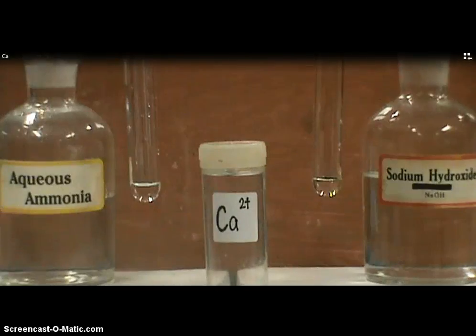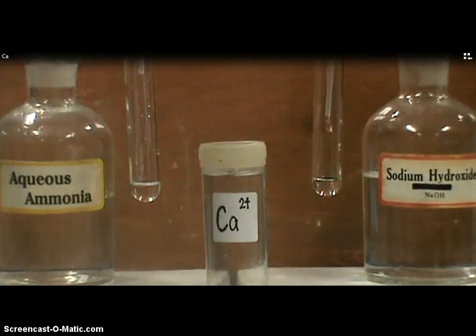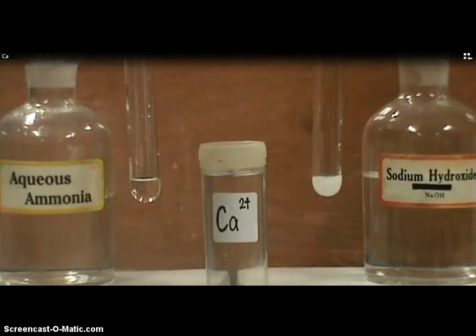Moving on, we'll examine the calcium ion. Notice that when a few drops of alkalines are added to solutions containing the calcium ion, a white precipitate is formed with aqueous sodium hydroxide, but there is no visible change with aqueous ammonia.